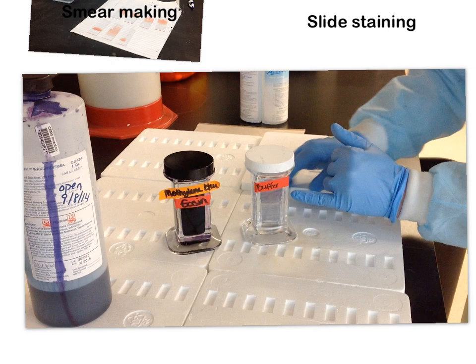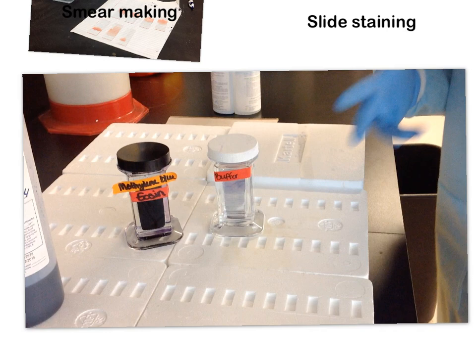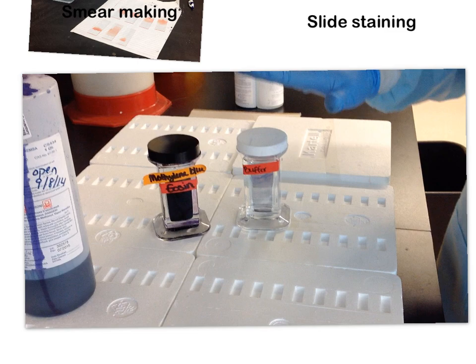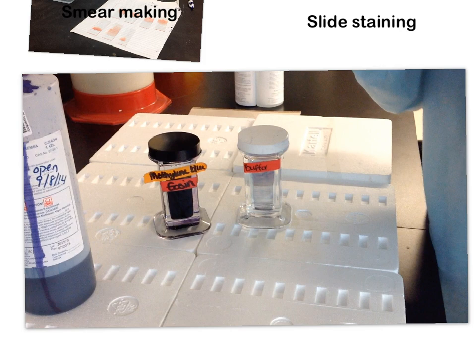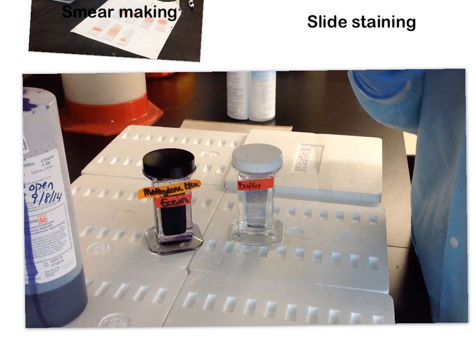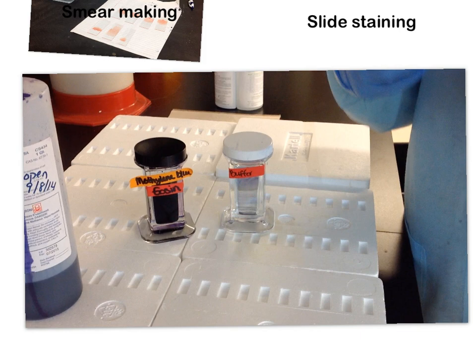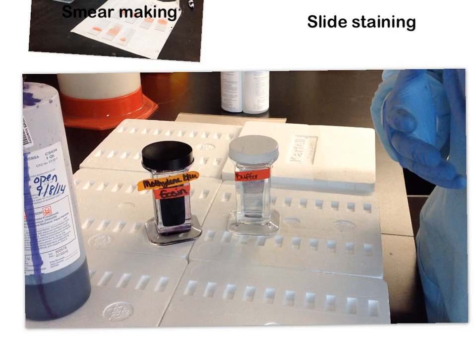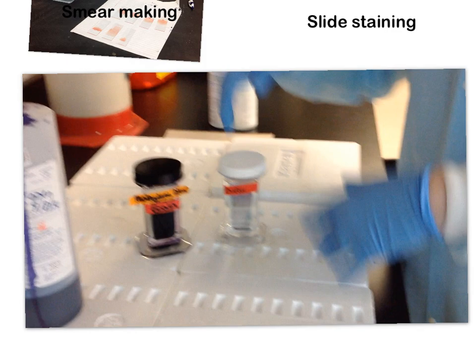Contrary to popular belief, the buffer step is the one actually staining your cells. You can see a purple layer forming around your slide — that's residual stain being acted on by the buffer. The buffer allows the cells, now stuck to the surface, to take up that residual stain. The acidic pieces of the cell — RNA and DNA — eat up the basic methylene blue stain. The basic portions — hemoglobin and eosin granules, the acidophilic parts — eat up the acid stain, the eosin.